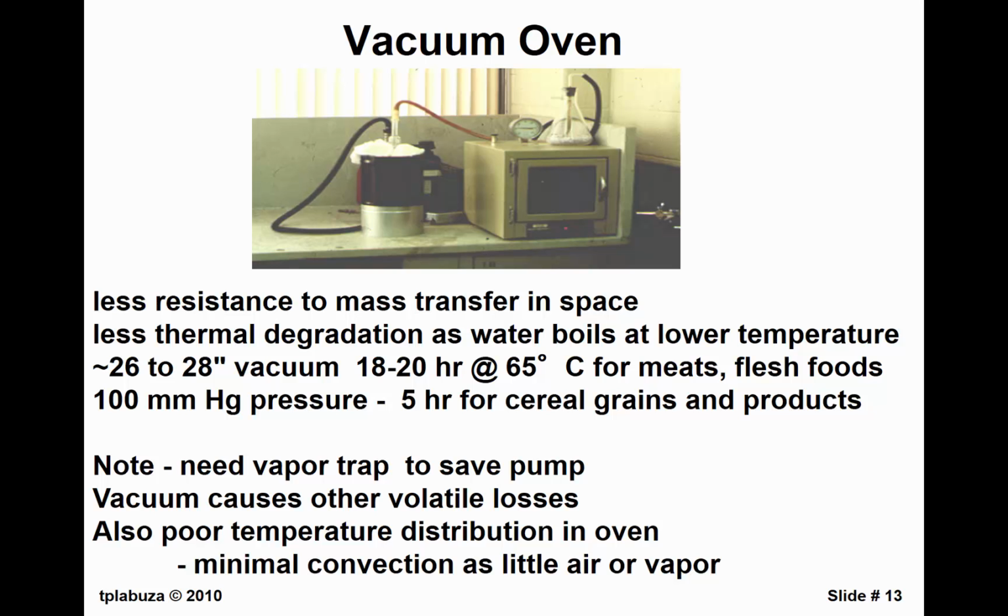What's coming out of the vacuum oven? Water. Water, right? And it goes into a compressor that's basically taking the water and squeezing it out from a low pressure to a higher pressure. And metal and water and movement causes rust.